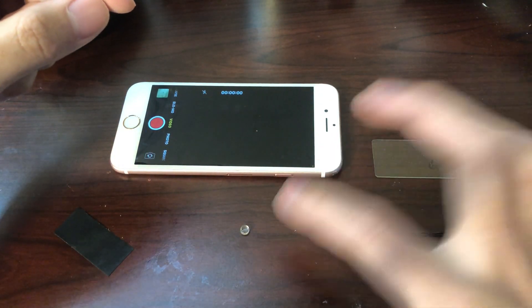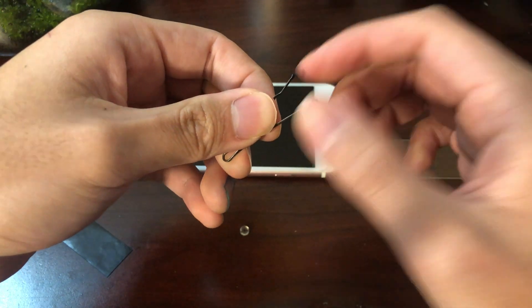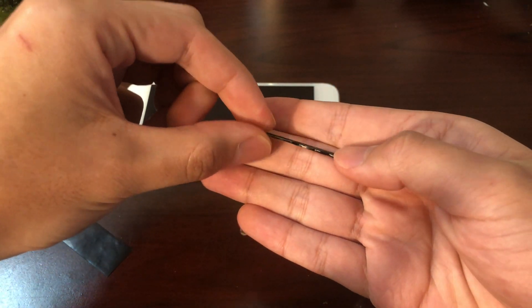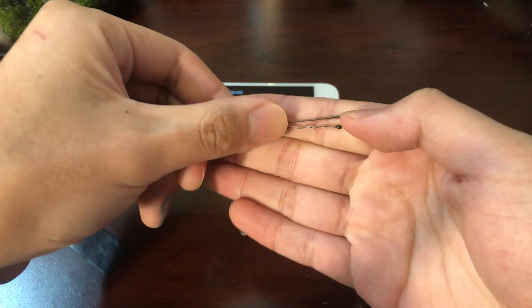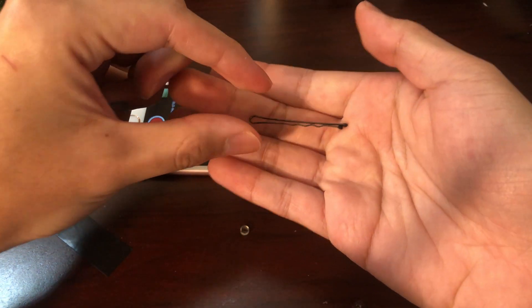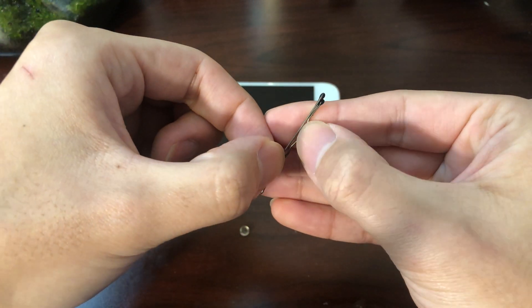Be really careful because it rolls everywhere. Now this last thing is just a bobby pin for the hair. If you have long hair or know someone who does, chances are they'll have bobby pins, and if not you can go to any store with hair products. Be really careful when you're looking for them — you want to make sure you find the ones with these folds on one side, these wavy up and downs.